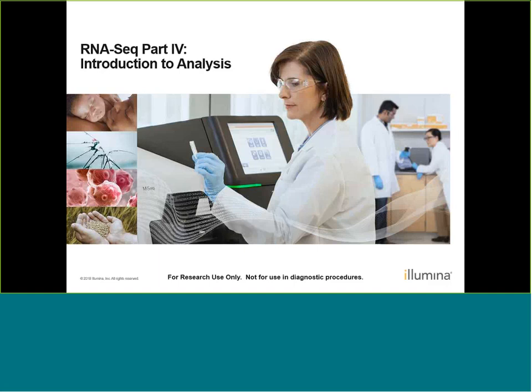Today's webinar is Introduction to RNA-Seq Analysis. This is part 4 of our 4-part RNA-Seq Webinar Series. You can find recordings of part 1, 2, and 3 on our support site. Part 1 mainly covers an introduction to RNA sequencing. Part 2 discusses the kits that you can use, and Part 3 will discuss best practices. Okay, so let's jump into our Introduction to Analysis.